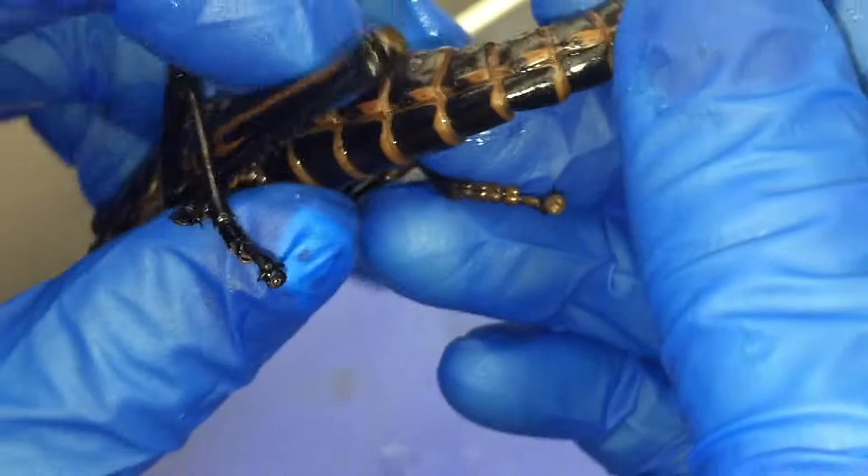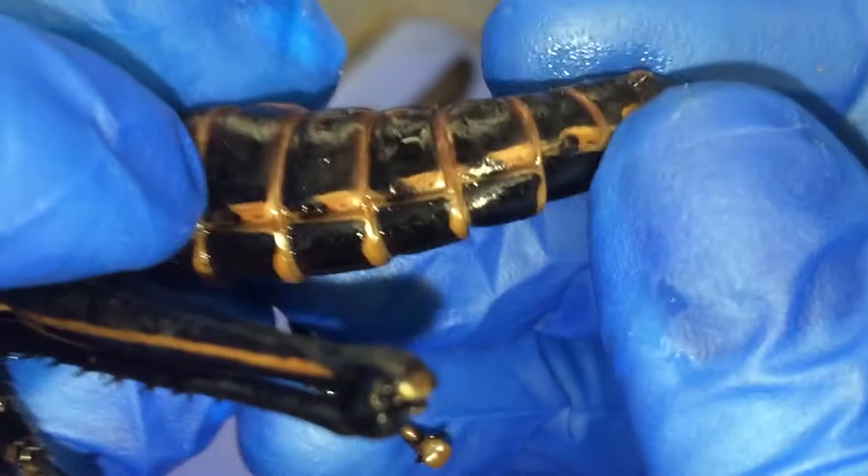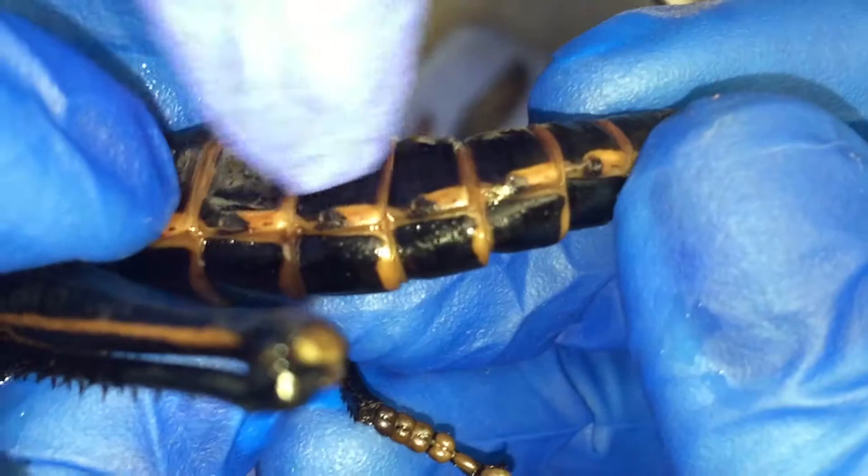Oh wait, can you see it at all? That's my hand — why are you filming my hand? I thought you could see it. I thought it was like the little dots, the little black dots. Right where the brown is, there are even tinier dots in there.